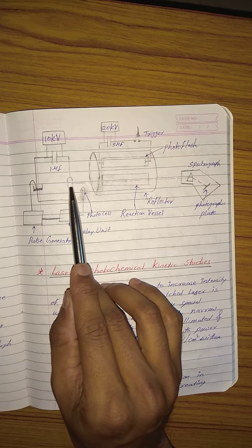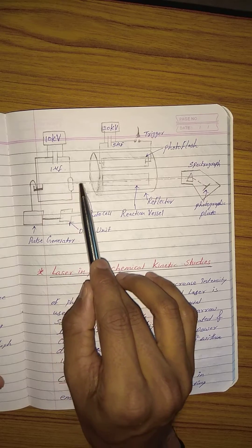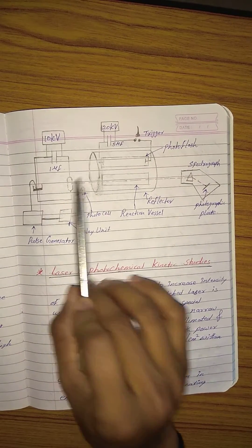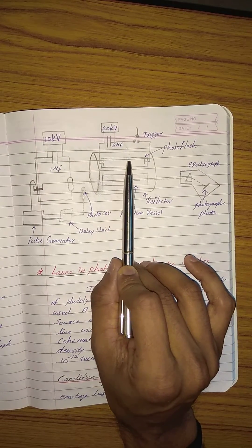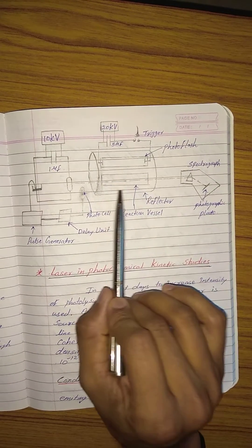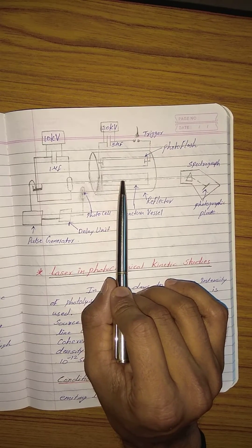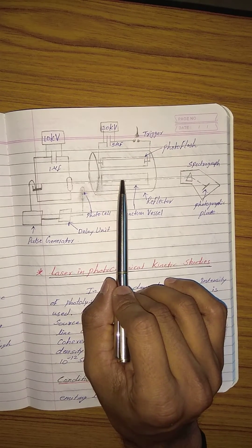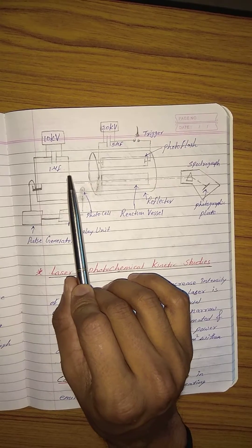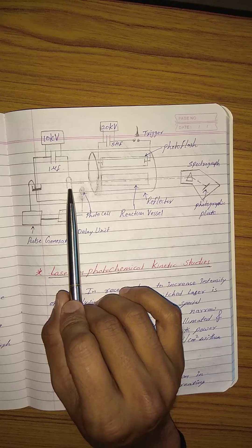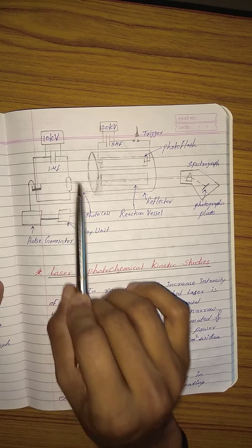This single beam absorption spectroscopy is somewhat like a colorimetric instrument. This is a secondary light, and this is a primary flash light. Using this primary flash light, the reaction is carried out in this reaction vessel, and the concentration of intermediates generated is measured using this secondary light generated by this particular bulb.